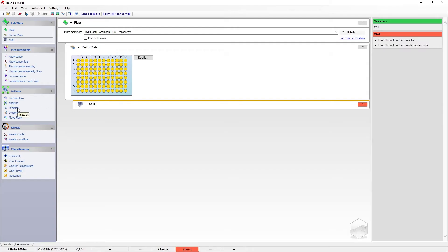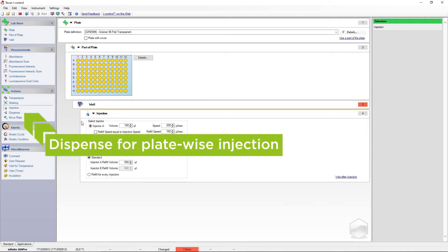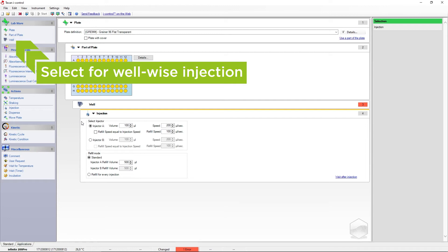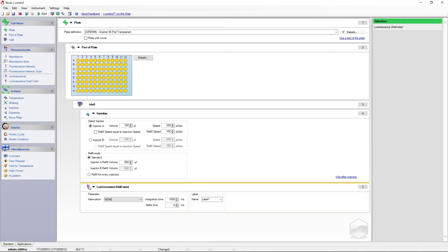To perform an injection step, drag and drop the injector strip into the work pane. The injector can be used in two distinct modes. Dispense will inject the entire plate in a plate-wise fashion and then perform any subsequent steps such as a measurement. When used in combination with the well strip, injection can be used to inject a single well followed directly by a measurement action. This can be used for fast kinetic applications like flash luminescence.